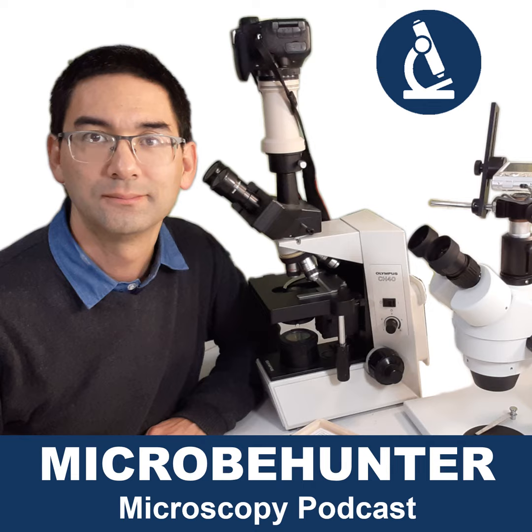If, on the other hand, you insert a filter into the light beam of a 160mm objective, where the light beam is already converging, then this has an effect. So the infinity objectives allow you a little more flexibility in inserting filters and special types of intermediate optical elements without changing the picture of the microscope so much. That is the technical advantage.